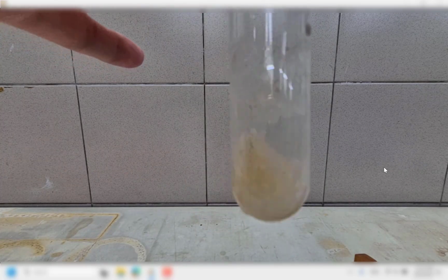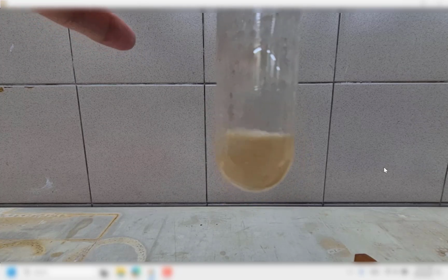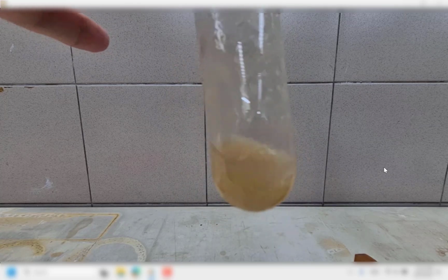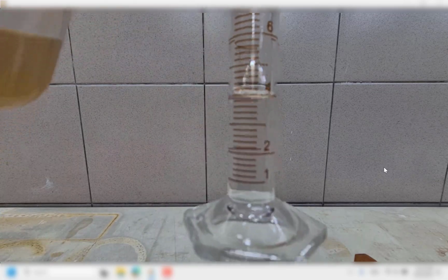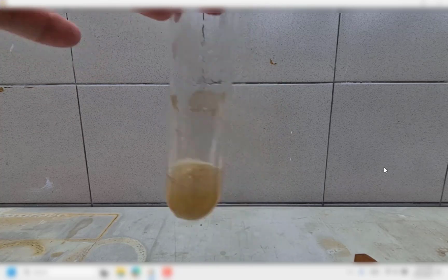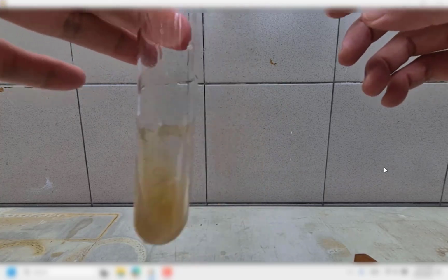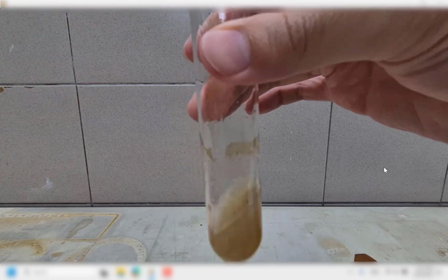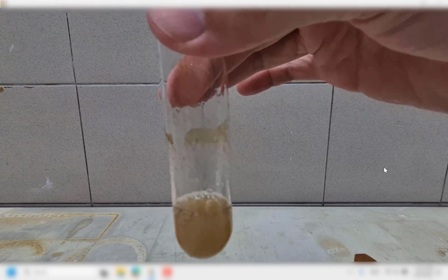We just add in more and more, and then you notice the side of the test tubes, the wall of the test tubes. It's clearly that there's a brown stain there. Some of you commented that the solution is brown color. But take note that in this case our focus would largely be on the appearance of the PPT, because you can't really tell them apart given such a mixture. You notice that about two fingers below, the wall of the test tube is actually quite brownish in color.